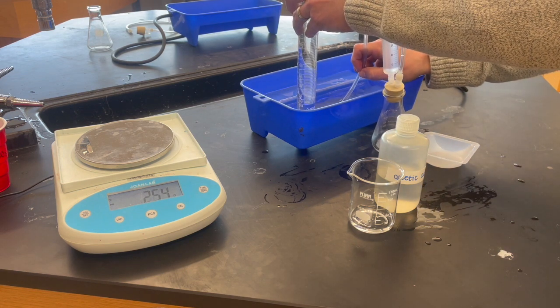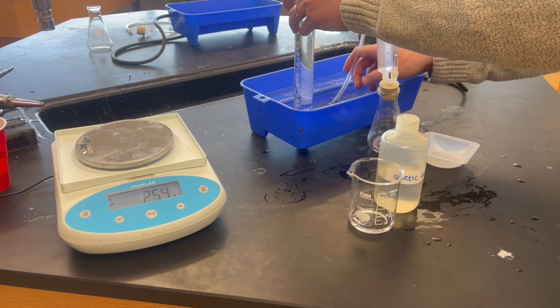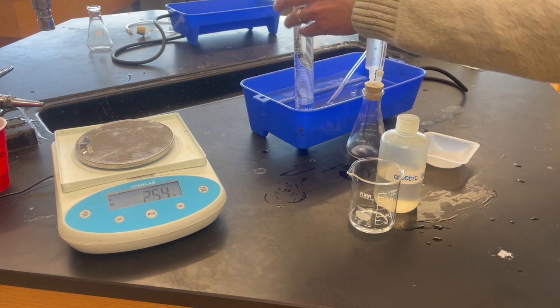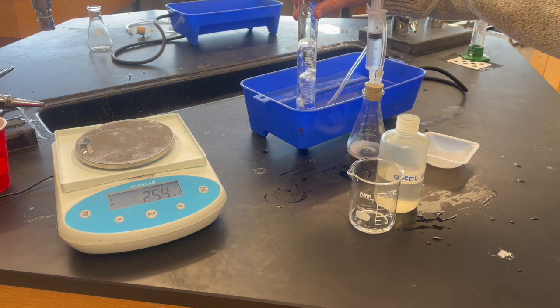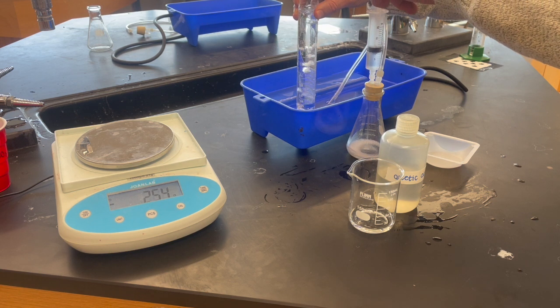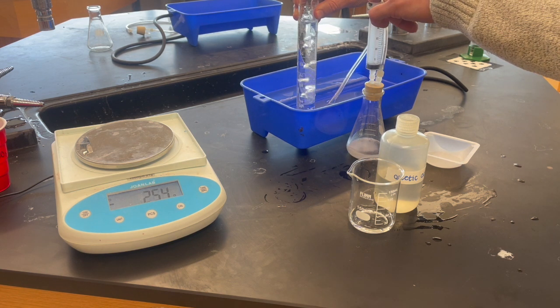As you can see here, I thread the end of the rubber tubing down under the level of the water and under the graduated cylinder. Now I'm going to press down gently on the syringe to transfer the vinegar and baking soda together.